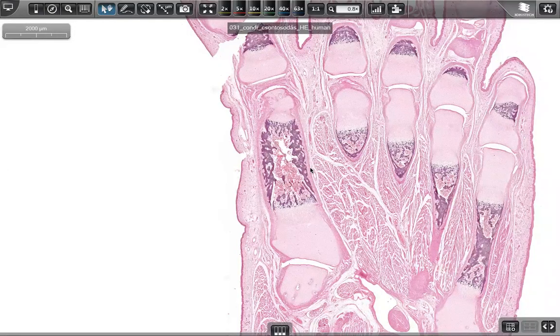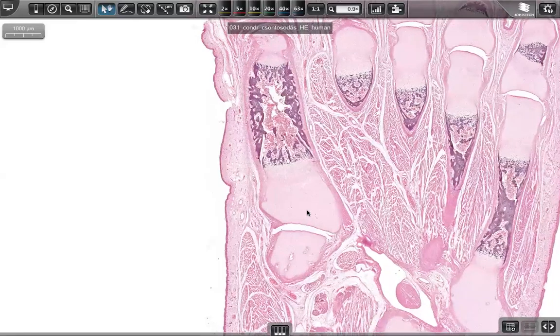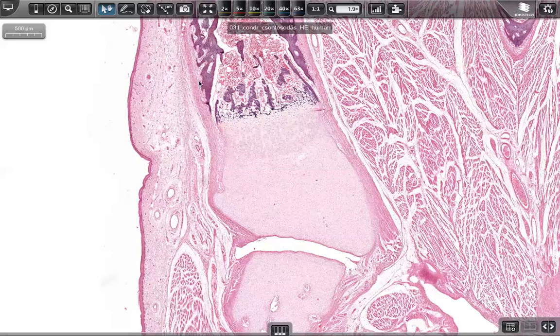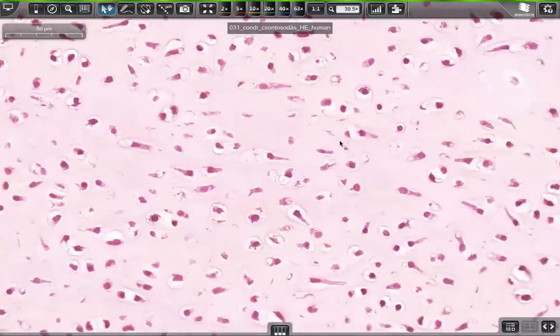You know, I told you the cartilage receives nutrients from the neighboring vessels. So that collar eventually deprives the mid portion of the cartilage of the nutrients, causing degeneration in the cartilaginous tissue. Therefore, we can distinguish different zones in the developing bone. So that area which is far away from the bony collar shows normal appearance of the cartilage. So we have typical hyaline cartilage with chondrons.